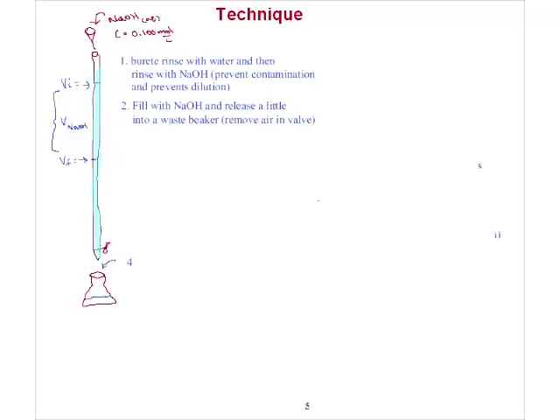The next thing we have to do here, what are we doing? We're going to get a sample of vinegar here now, and we're going to use a delivery pipette here. And it's going to be very accurate, 10.00 mL. Remember, we talked about this as being a very accurate aliquot. It's an accurate measurement. And you guys did pipetting, of course, in 2202, so I don't have to review much of that here. But the same thing applies here.